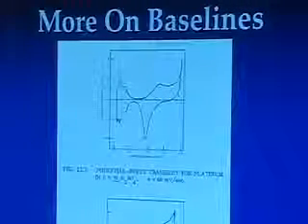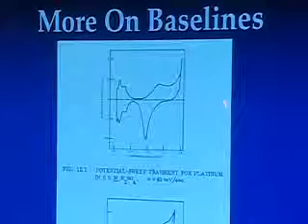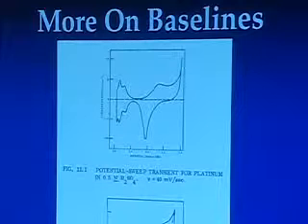So if you have your current scale set so that it's fairly sensitive, your baseline, instead of being a fairly flat thing, will look like this. Now, someone could get a cyclic voltammogram that looked like that when they've intentionally added some electroactive species in there and try and assign some of these peaks to some of the stuff they added to solution. They would be fooled.